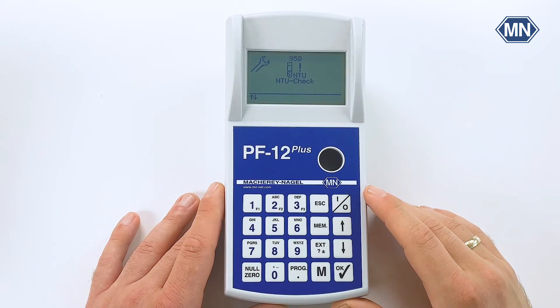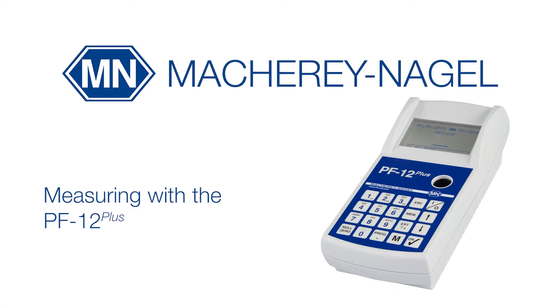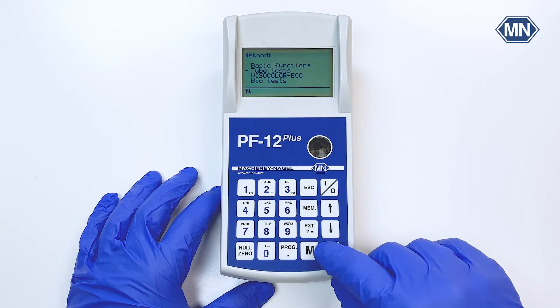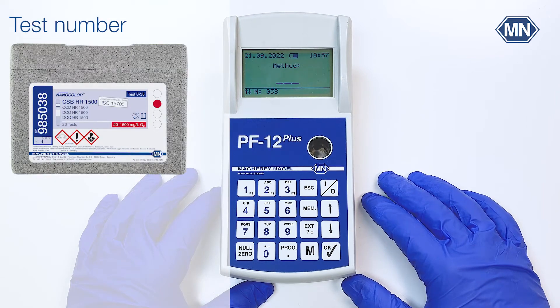Other important features are the measurement range, the automatic reaction time, or the auto-off function. But now let us measure our first sample. To enter the test menu you could either choose from a list of tests or simply enter the test number in the home screen of the photometer.